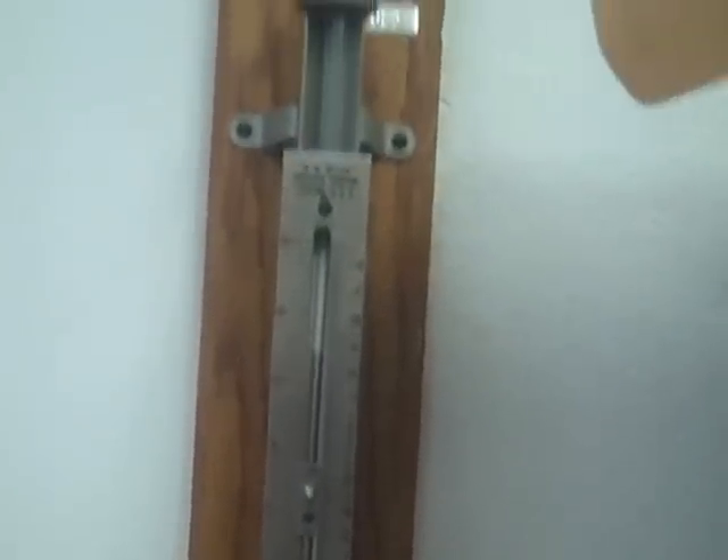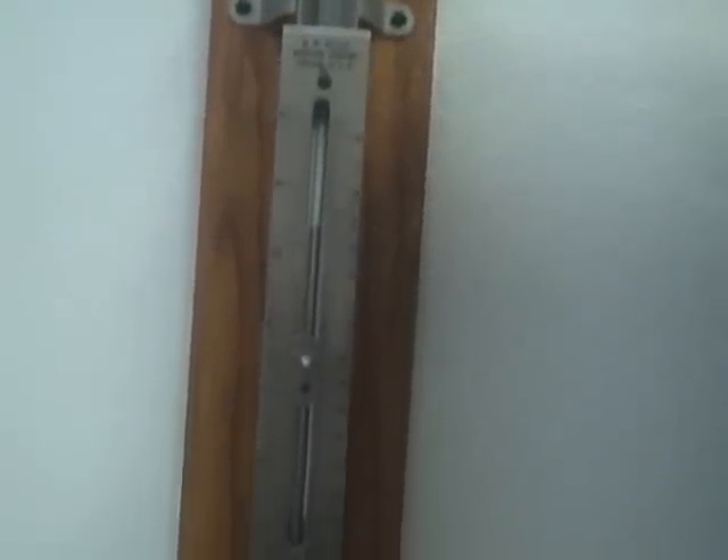Hi everybody, I'm Garrett and today I'm going to teach you how to use the barometer. The barometer is used for measuring pressure so that when we do a lab that involves the atmospheric pressure in the chemistry lab, we can use this here so that we know what the pressure in the room is.